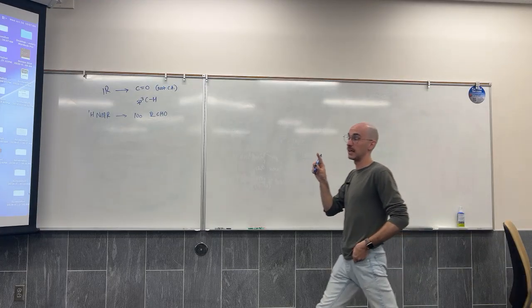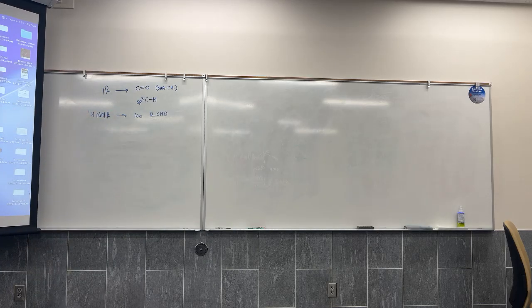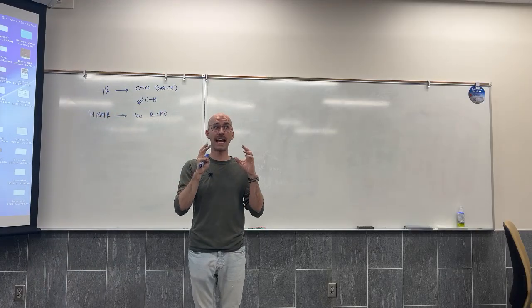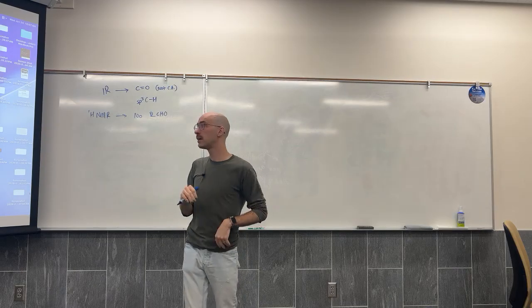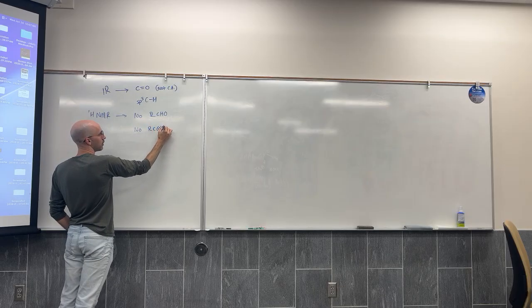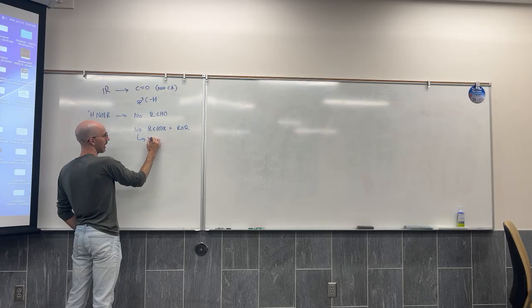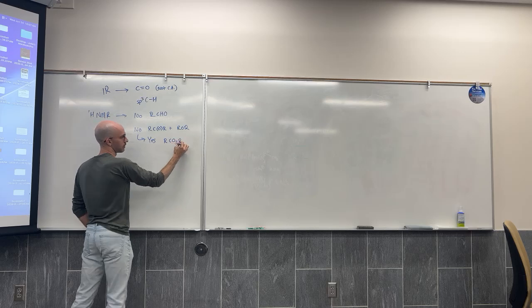But then we said, well, I said, the proton NMR confirms that it's an ester and not a combination of a ketone and an ether. Can you guys reiterate how I felt confident that it was not a ketone plus an ether, but it was instead an ester?